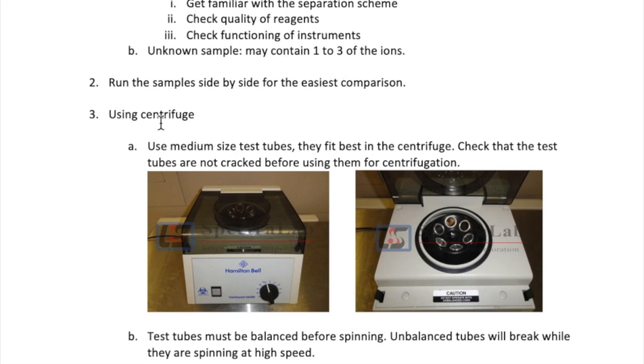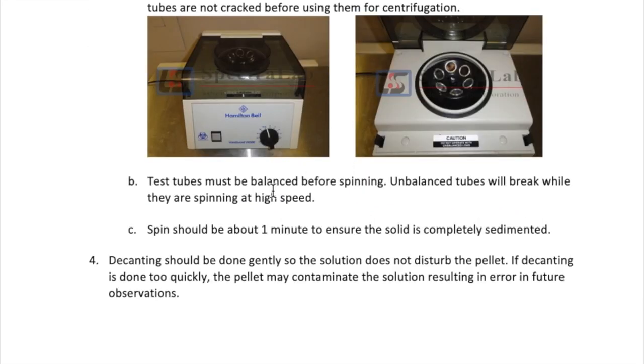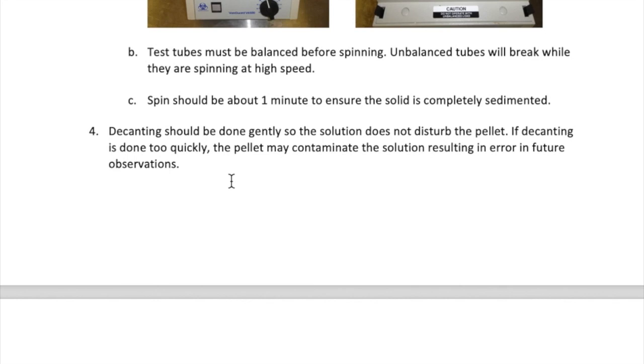Alright, now let's talk about some guidelines for using the centrifuge. First, use medium sized test tubes. These fit the best in the centrifuge. Check that the test tubes are not cracked on the bottom or the side before you put them in the centrifuge. In addition, make sure each test tube is balanced with another right opposite it in the centrifuge. Unbalanced or cracked test tubes will break at the high speed spin of the centrifuge. Spin for about a minute to ensure that all your solid is completely sedimented to the bottom of the test tube. You should decant gently so as not to disturb the pellet at the bottom of the tube. If some of the pellet gets carried to the tube that is only supposed to have solution, you now have a contaminating ion which will complicate your observations and may lead you to the wrong conclusion.